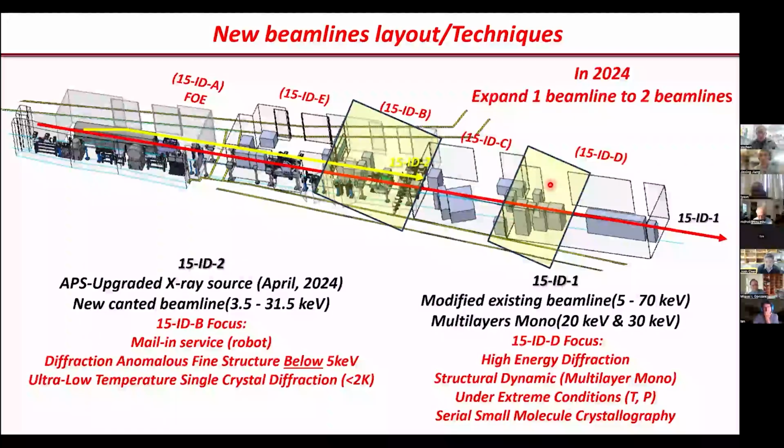I've got a question. The Oxford N-Helix cryostream, is that going to be available on a particular beamline, on a particular hutch, or is it transferable between the two? I would like to put it in ID1, but if needed, we can transfer it to ID2.